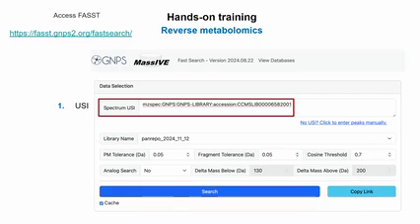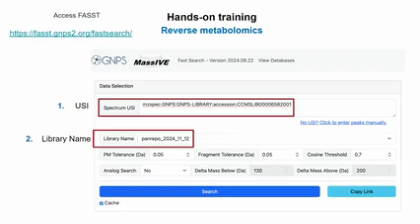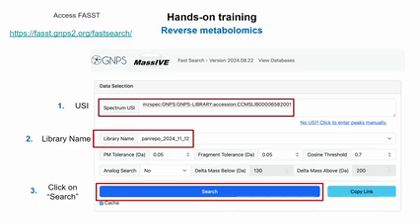For the second step, you have to choose the library name. There are multiple libraries there, and there was recently an update. So there's also one that has 2025 in the name, so just use that one, which is the newest version of it. Other parameters, today we are keeping as default. And then you just click on search here.